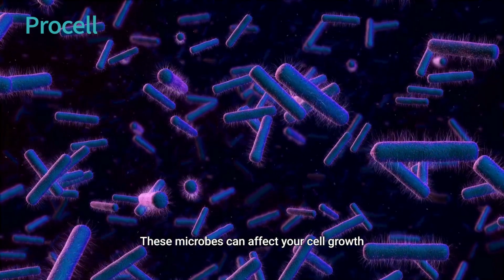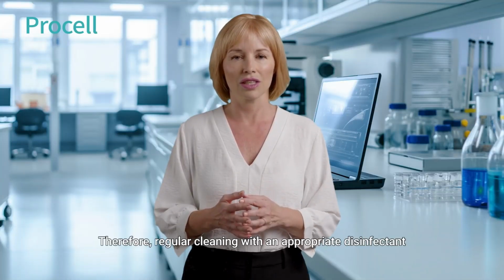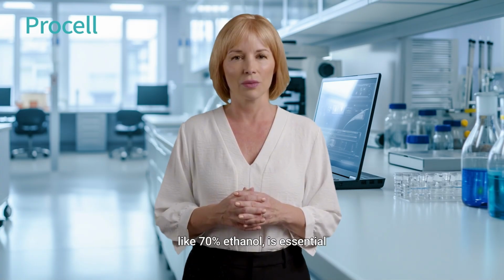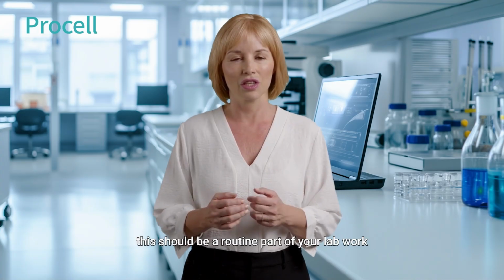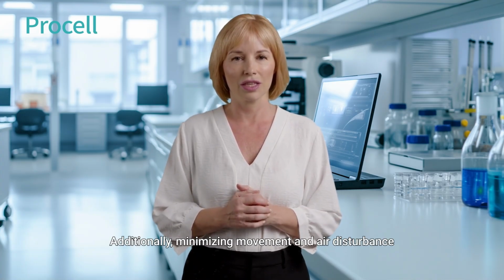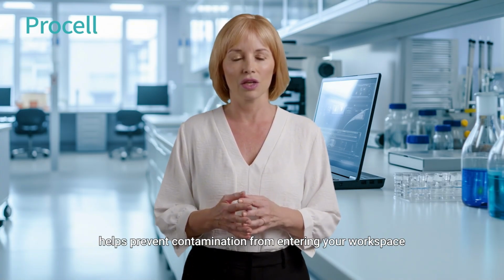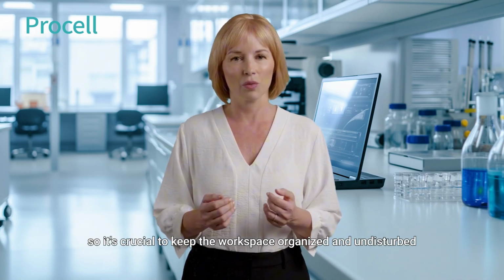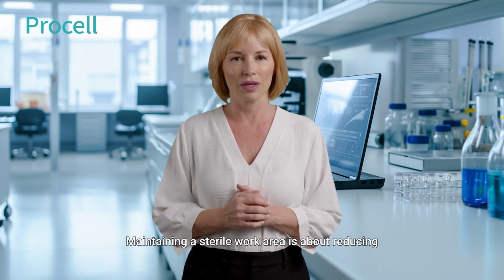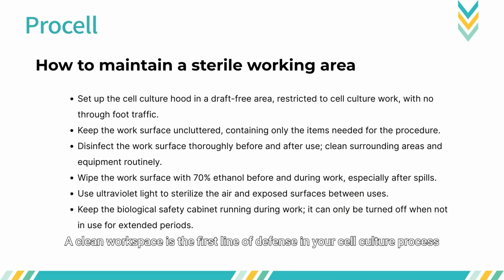These microbes can affect your cell growth and in some cases completely ruin your experiment. Therefore, regular cleaning with an appropriate disinfectant, like 70% ethanol, is essential. This doesn't just mean wiping down surfaces once in a while. This should be a routine part of your lab work. Additionally, minimizing movement and air disturbance helps prevent contamination from entering your workspace. Air turbulence can carry contaminants from the environment, so it's crucial to keep the workspace organized and undisturbed. Maintaining a sterile work area is about reducing the risk of contamination at the source. A clean workspace is the first line of defense in your cell culture process.